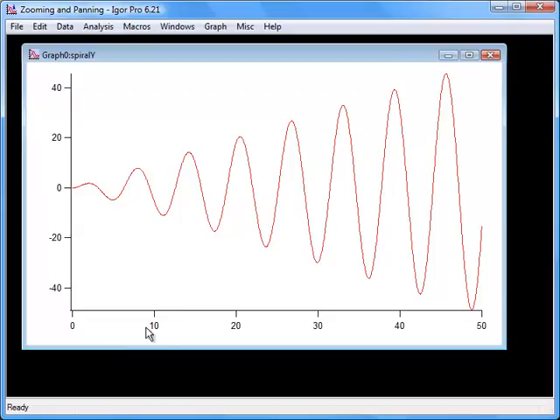Position the cursor in the interior of the graph. The cursor changes to a crosshair shape. Now, to zoom in on the graph, click and drag down and to the right to create a marquee, as shown.